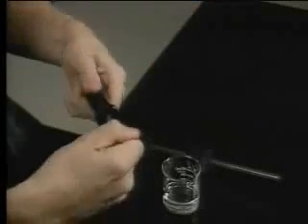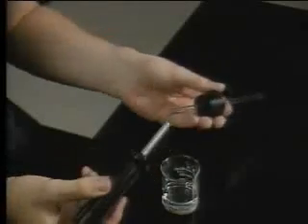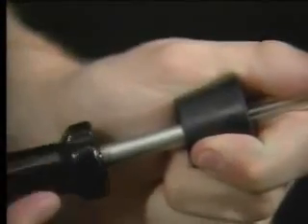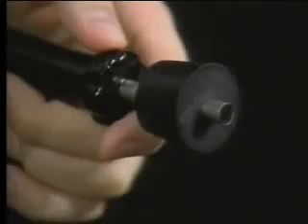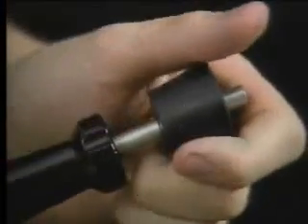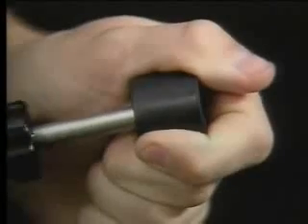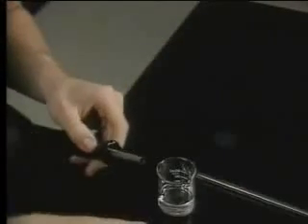To remove the tubing, take out the tip and lubricate the end of the hollow shaft. Push it through the stopper hole around the tubing. Then slide the tubing out through the shaft and remove the inserter. Remember to wash the lubricant off before returning the stopper and tubing to storage. And don't forget to replace the tip.